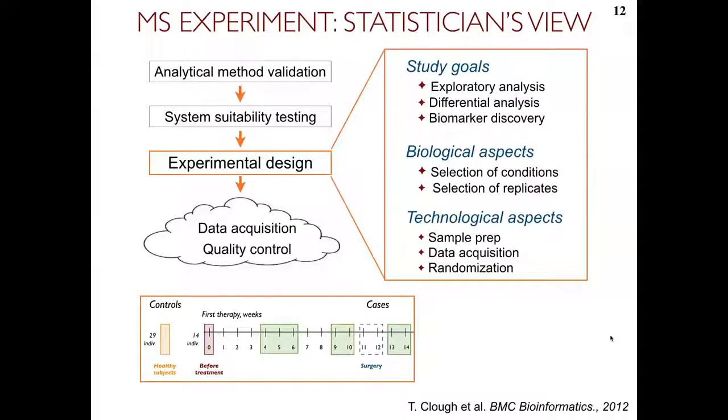And so their questions were also fairly complicated. For example, which proteins are differentially regulated between controls and disease at diagnosis, but they also wanted to know which proteins in time came back to levels comparable to the controls and which proteins never came back. So again, this would require a different type of statistical analysis because there is a time course aspect of this, meaning on the same person we have multiple measurements, and it has to be analyzed differently.